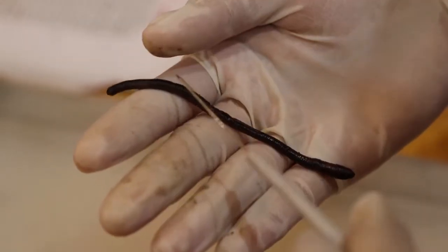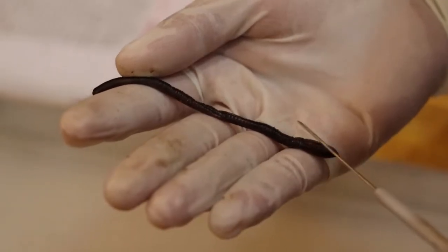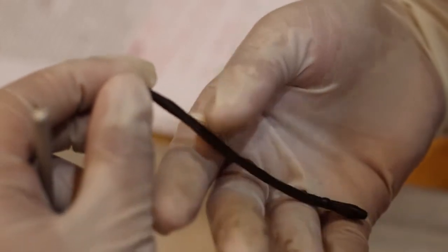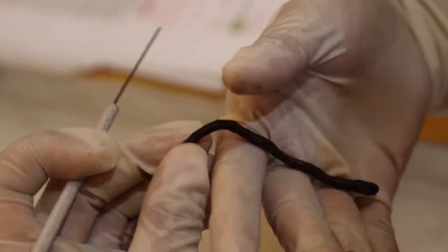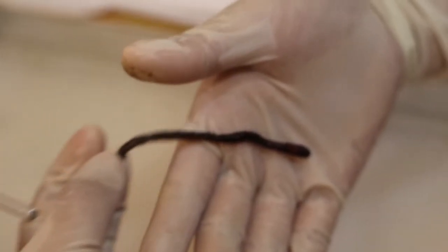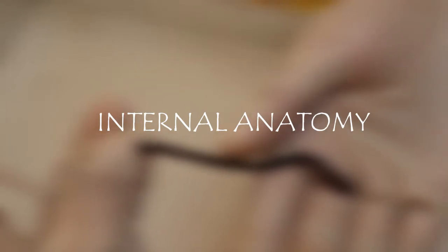So observe this one. The top is what you call the dorsal. The dorsal side is darker than the ventral side of the earthworm. Can you see? The lighter one. And the dorsal is darker. So now, let's move on to the internal anatomy of the earthworm.